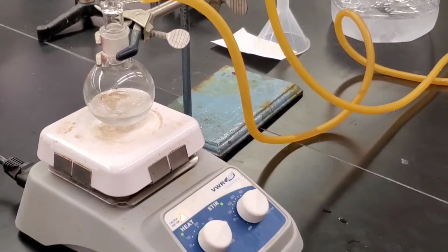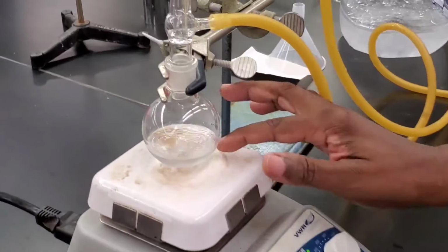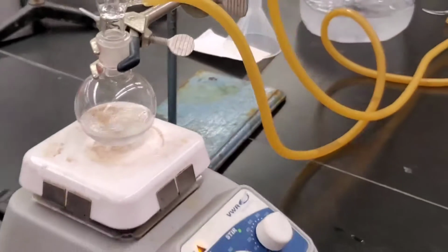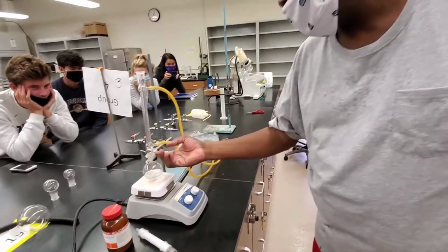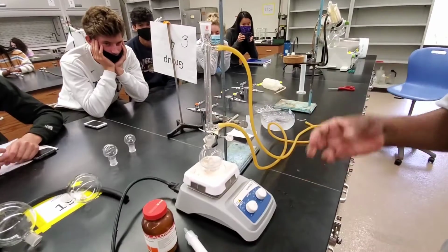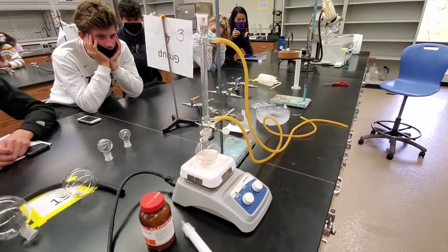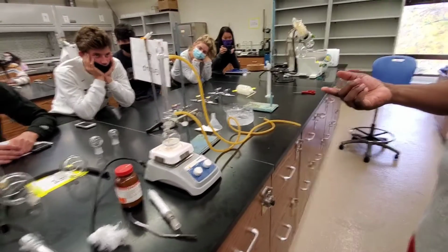And what will happen is the liquid in here, the solvent, becomes hot. It's going to start to evaporate. The vapors are going to start moving up. They're going to hit a cold surface. This cold surface, that inner tube, is a cold surface now because of the water flowing. When it hits that cold surface, it will condense. So evaporation and condensation will take place.